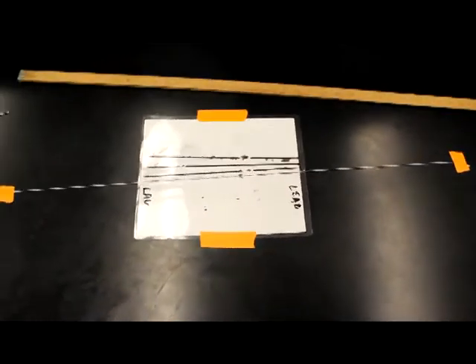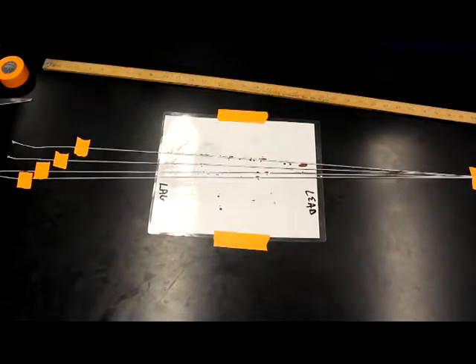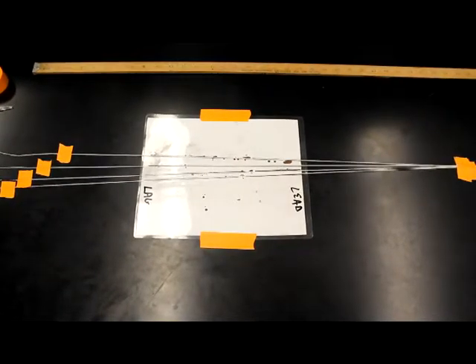Like so. And then you'll repeat that with all 4 blood spatter droplets. So what you can see here is we've laid out and followed the lines of all 4 of our blood spatter pattern droplets, and we can see from the lagging edge all the way to the leading edge to the point of convergence here. And you can see where all 4 of them naturally converge at this pattern. Now, your individual pattern will vary because each of these pages is different. You may actually end up with 2 sets that don't converge, or even 4 that never converge. So you need to look and see what you've actually got on your individual page.